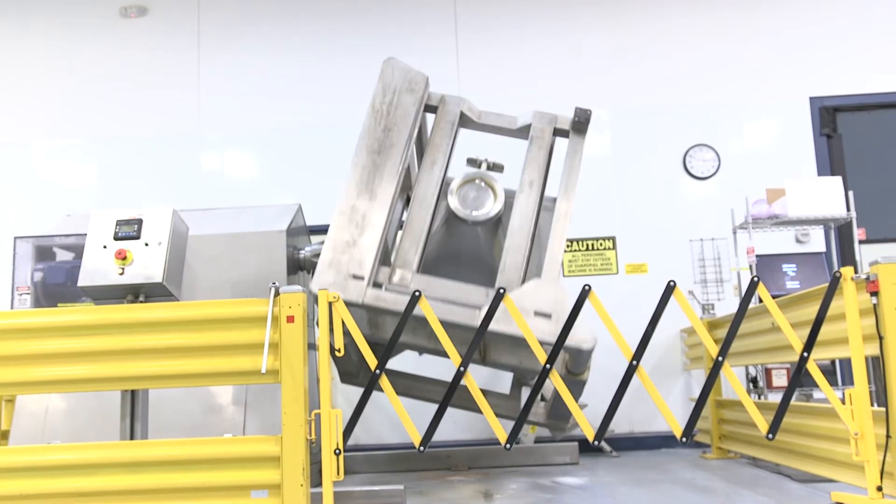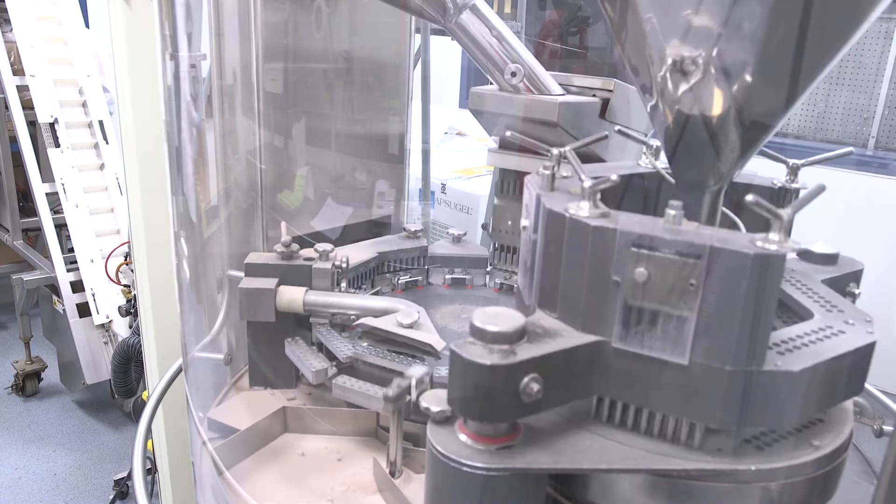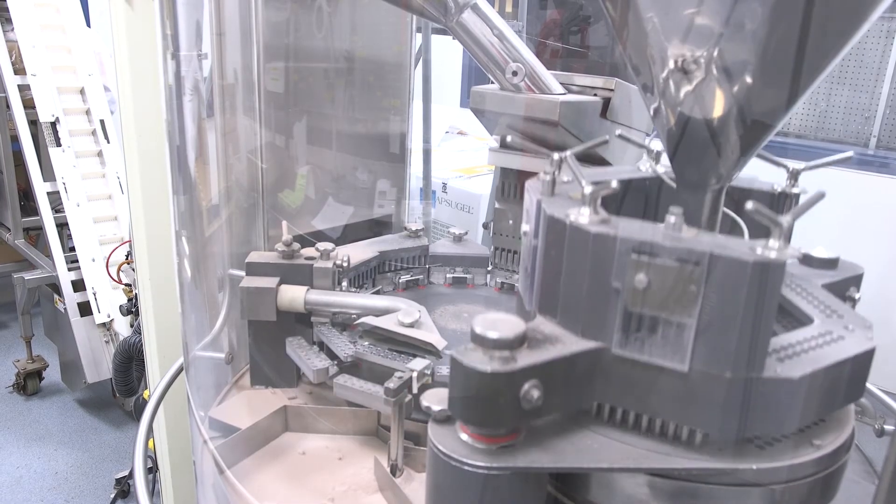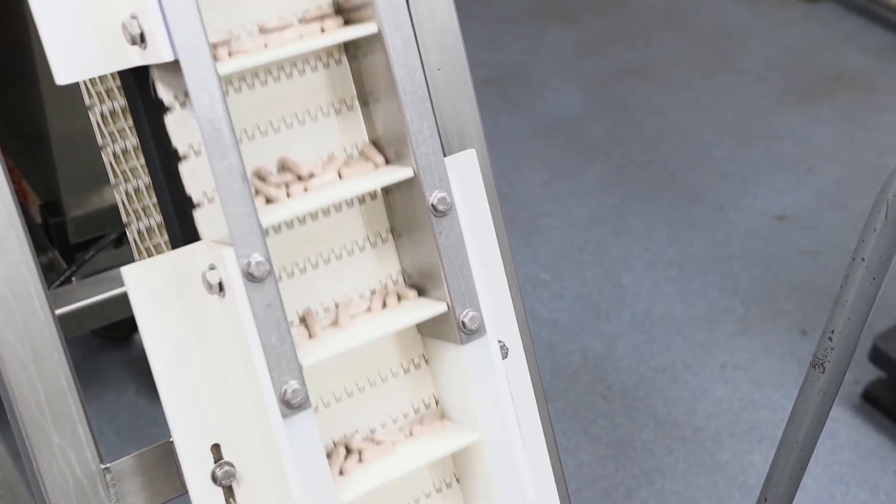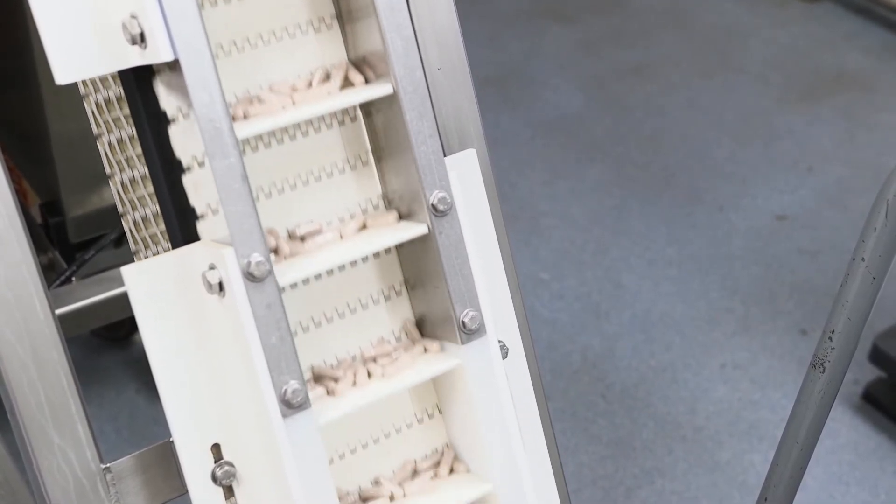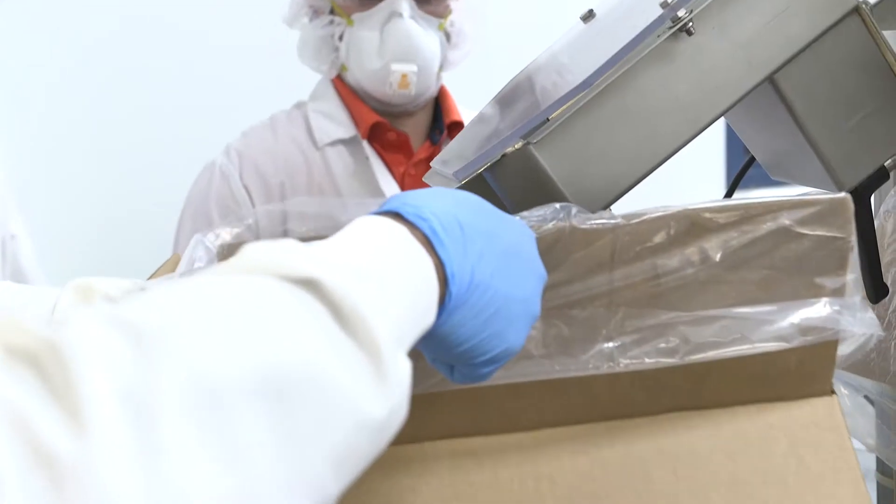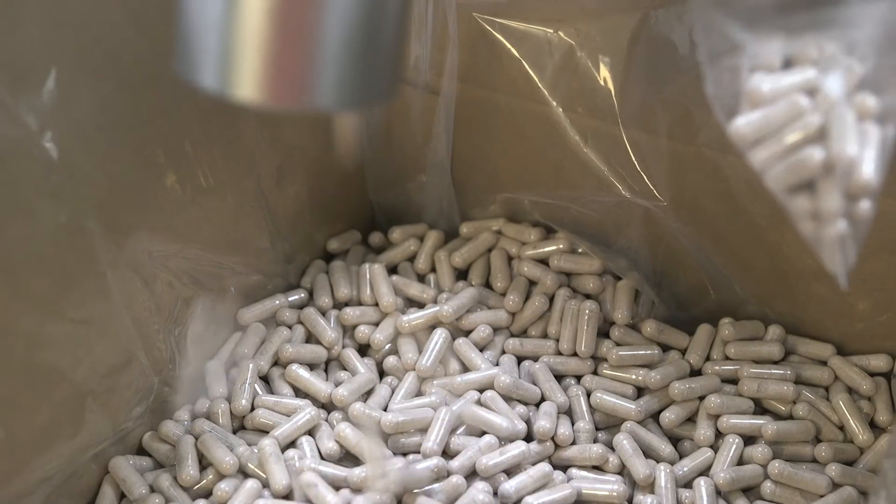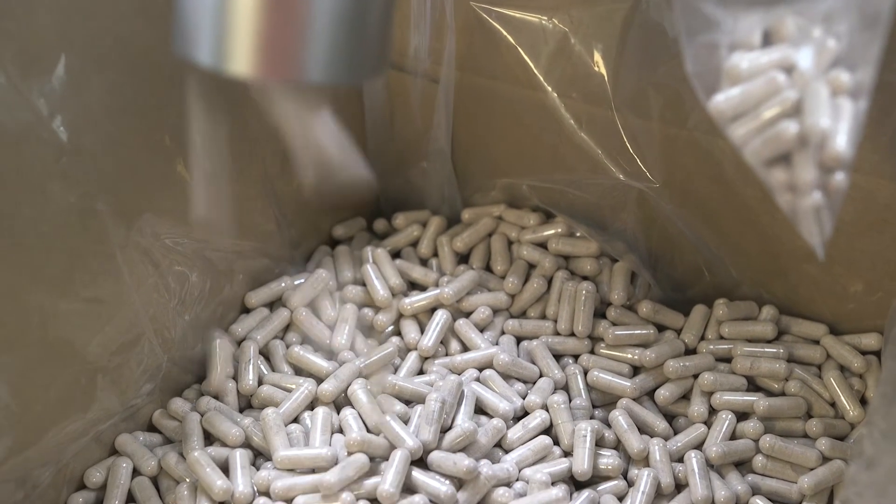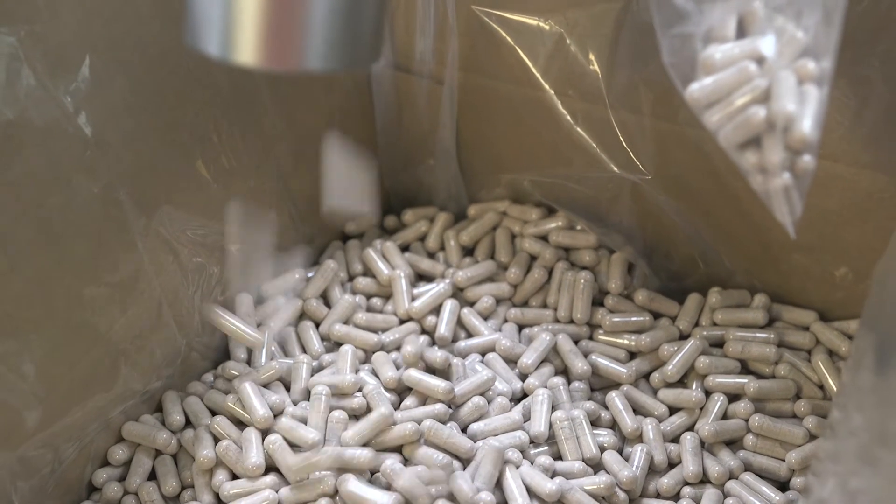And we'll take that tote to a docking station and then we gravity feed down to our encapsulation machines. And the encapsulation machines basically are going to open an empty vegetarian capsule. The echinacea material, the echinacea blend, will be added to the capsule. It'll be tamped at a couple of different stations and then the two-piece capsule is put back together and then it's ejected from the machine.